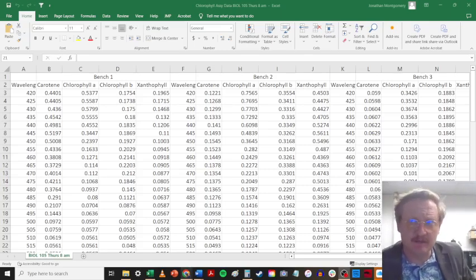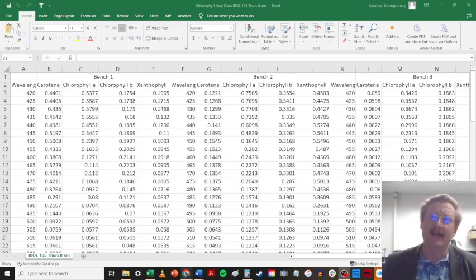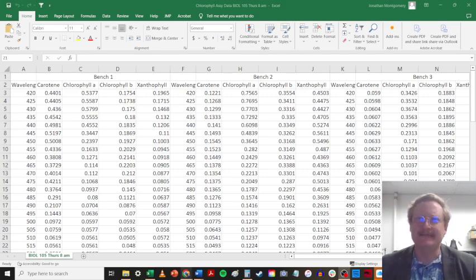All right, class, welcome to another demonstration recording. Today, I am demonstrating how to graph your pigment extract data.